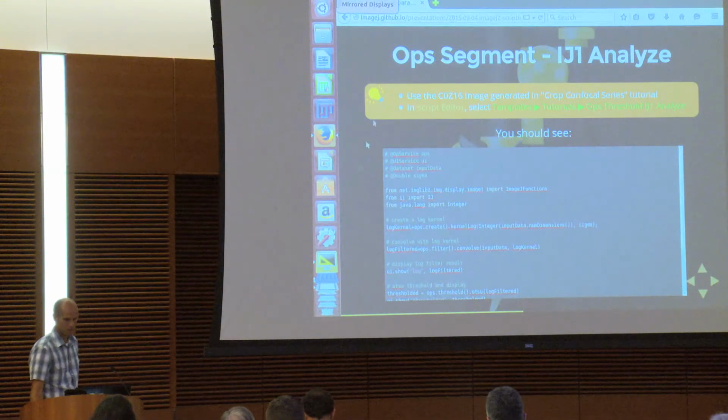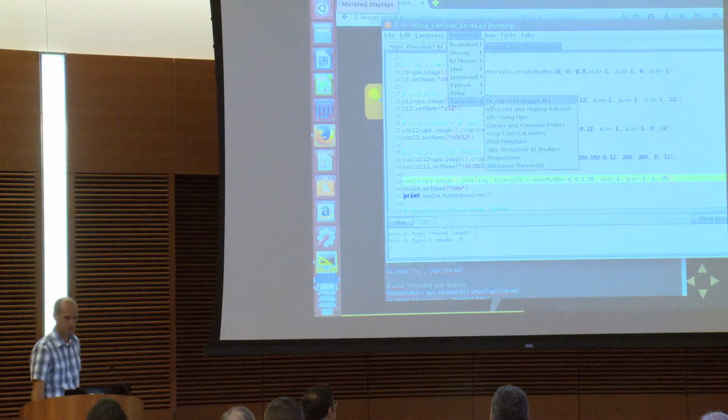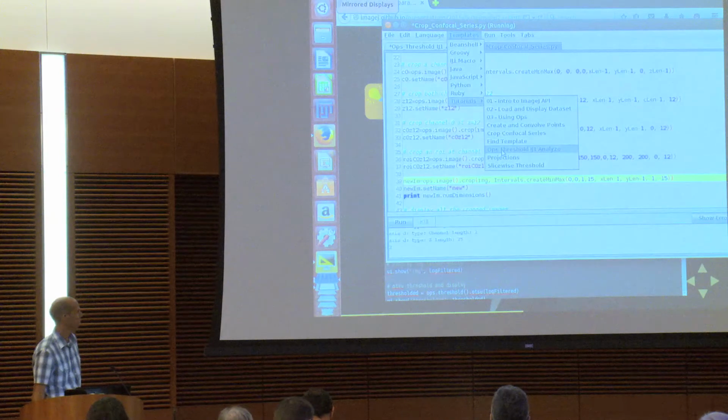So if you go to your script editor, go to tutorials, open up this ops threshold IJ1 analyze.